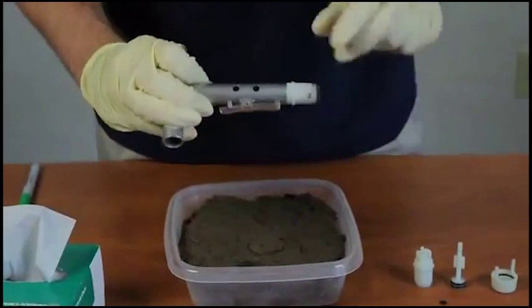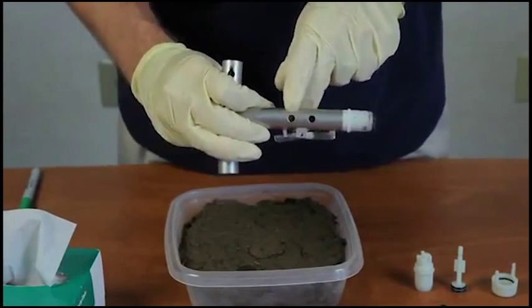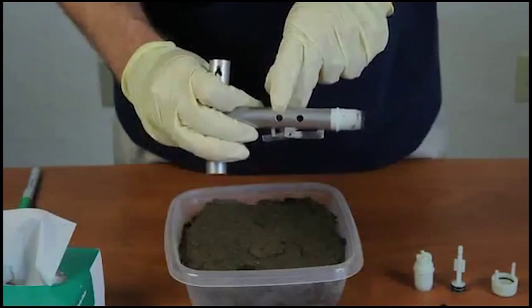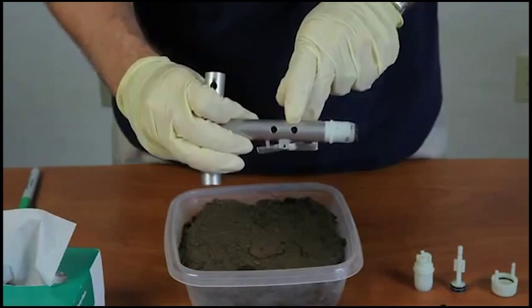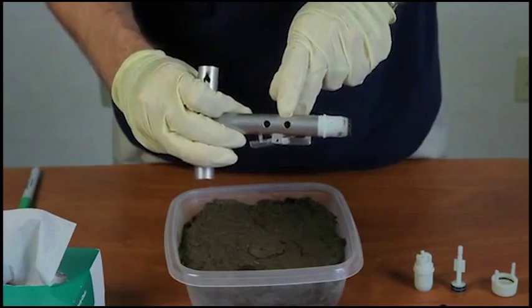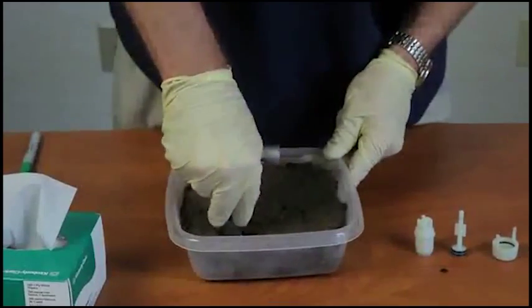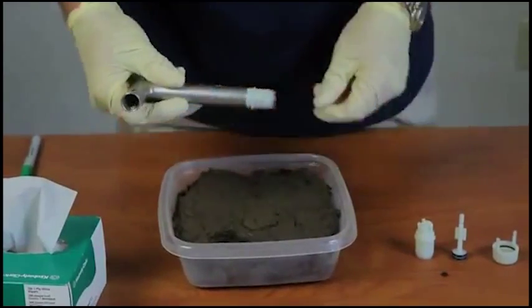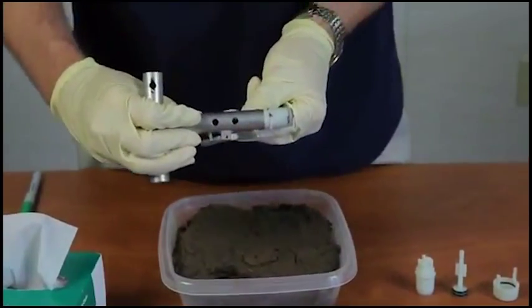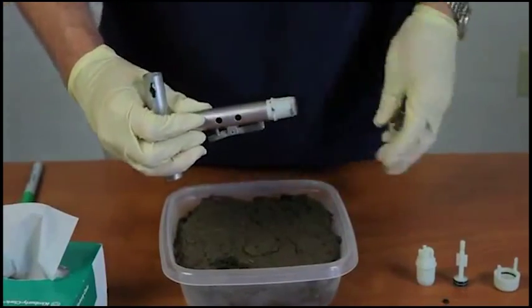After you take your sample, you want to look in through this first viewing hole here for the 5-gram sampler. This second hole is for the 25-gram sampler. We can see that the O-ring is not completely in the middle of this viewing hole, so we need to take additional sample. At this point, the O-ring is within the middle of the viewing hole, so that is correct.